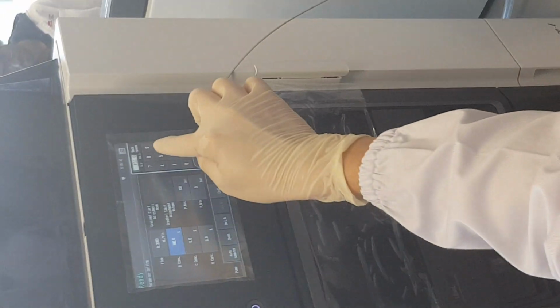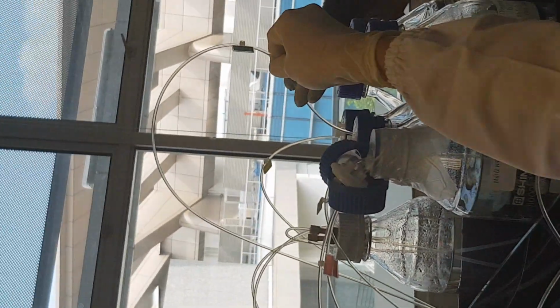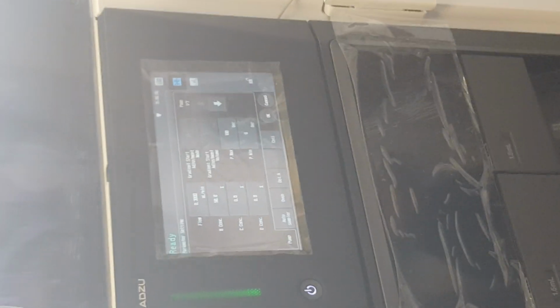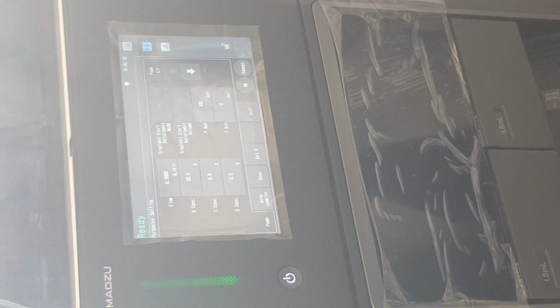So you just key in 50%. Clear? When you key in 50%, then you look at where is my acidified water. Okay, my acidified water is actually at pump A, solvent A. So if that's the case, no need to key anything. Automatically they will know that I have to draw the other 50% from pump A, solvent A.